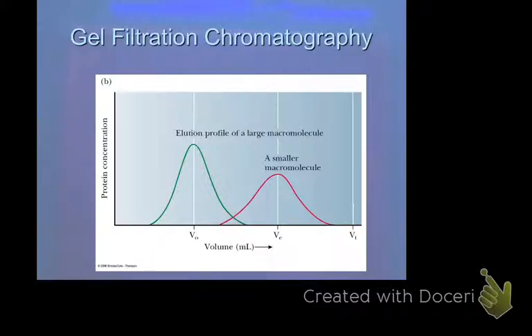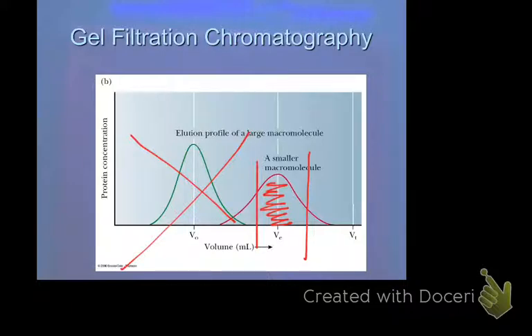For example, here, if we were looking for the small molecule, we would take the samples from this section to this section. You'd pull them together, and we would take all of this right here, put that in another beaker or whatever to go into the next purification method. And then we've effectively gotten rid of all of this contaminating stuff, plus anything that came off earlier, which they don't show here. That's why it's already relatively pure. But perhaps we're wanting something that's right, we don't know it, but we know maybe it's just this part right here. But we've got to be able to separate it out even better. So you do another method.